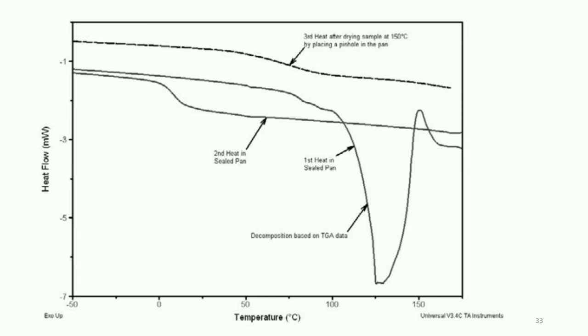Traditional differential scanning calorimetry provides a single signal, which is the sum of all thermal events occurring within the temperature range of the experiment. This often makes it difficult to interpret data or detect small transitions.